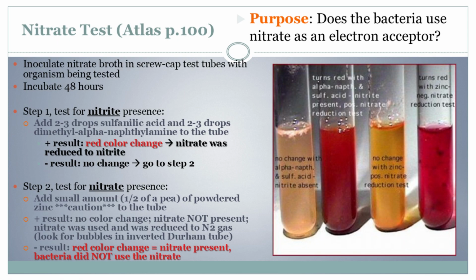All right, everybody, buckle up, because today we are diving deep into the world of the nitrate reduction test. A classic. It's a test that sounds, honestly, kind of dull at first glance. But trust me, once we unpack what's actually going on here, it's like a whole detective story unfolding at a microscopic level. It's true. And it all revolves around how certain bacteria have this incredible ability to breathe without even needing oxygen. It's like they have a secret backup air supply.